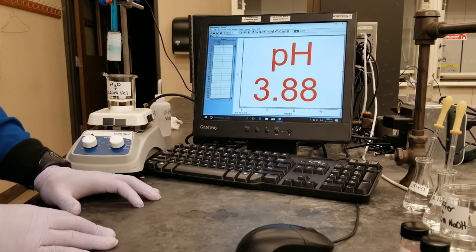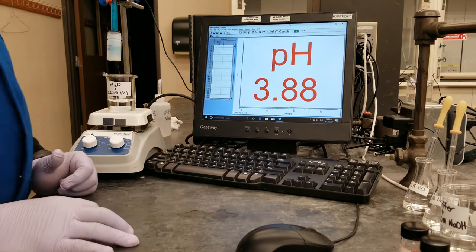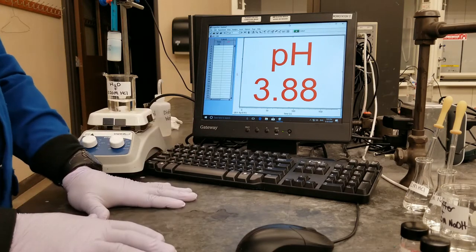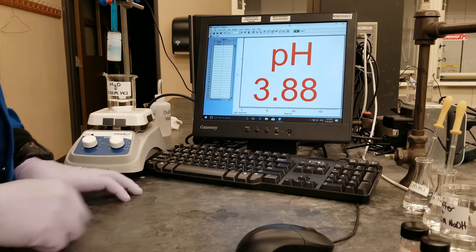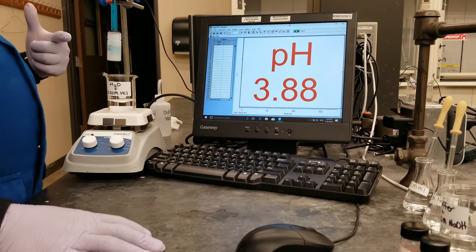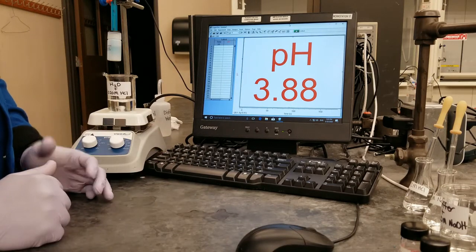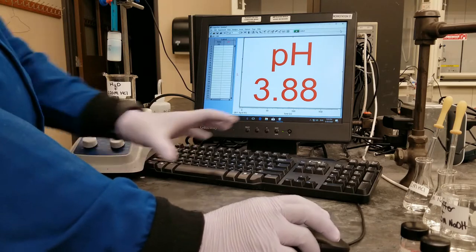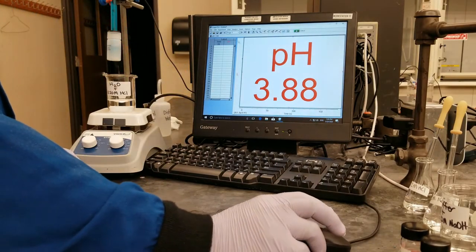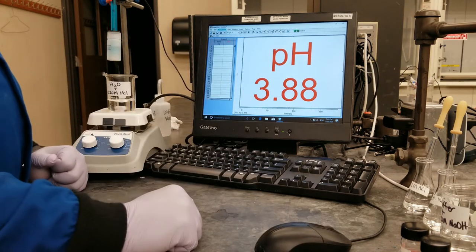Hello everyone, welcome to week 3 of CH109. Today we will be looking at buffers. To begin the experiment, we are going to first need to calibrate the pH probe. Just like in experiment 1, you must have learned how to calibrate the pH probe. I have already done that with this pH probe, so I am not going to go over that once again.